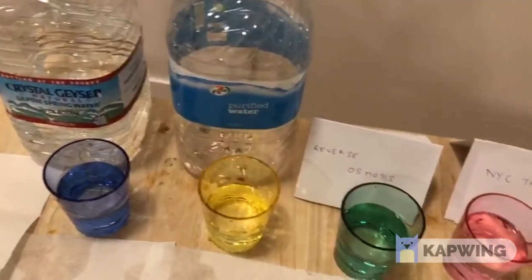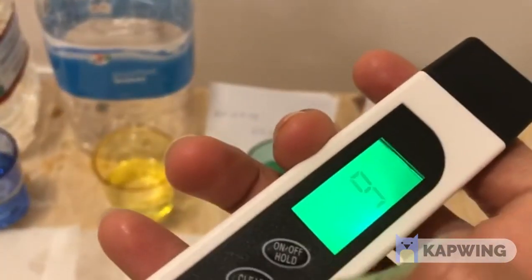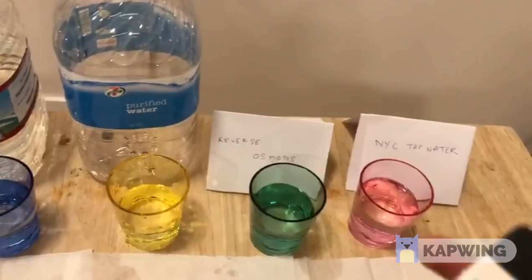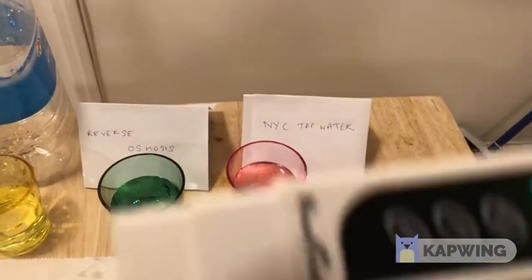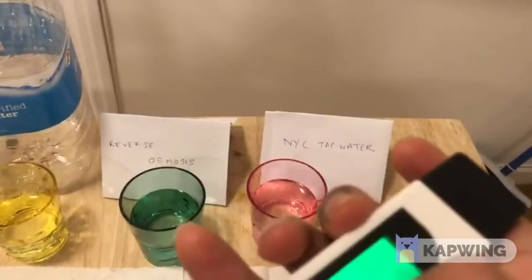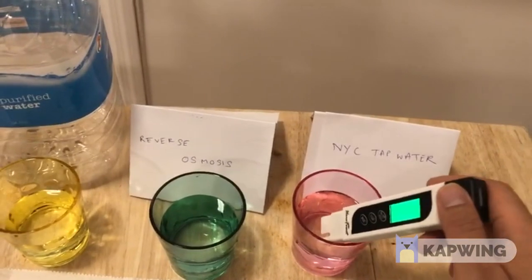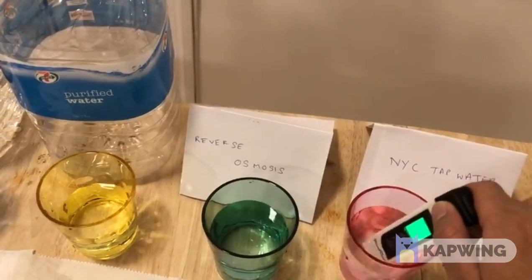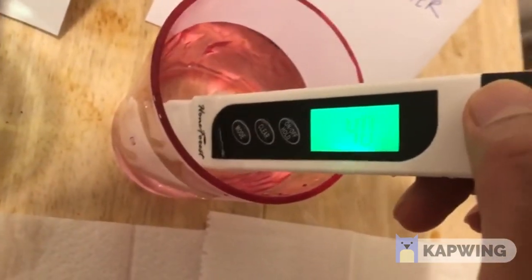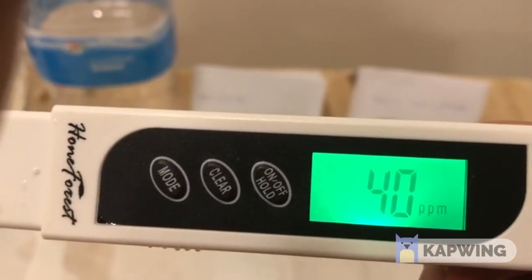A reverse osmosis system saves you the inconvenience of buying plastic bottles, and nine parts per million is very good quality drinking water. But now we go to the big question — what is the quality of NYC tap water? I just got this from the tap in my house. Always remember to set your device to clear so the value resets to zero PPM. Put it on the NYC tap water and shake it for at least four or five seconds so the value locks in. We're getting around 40 parts per million — New York tap water is 40 parts per million.